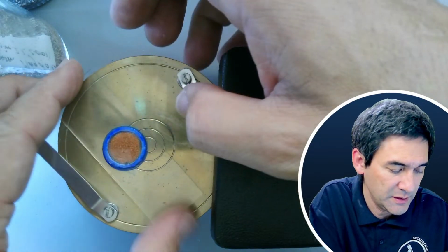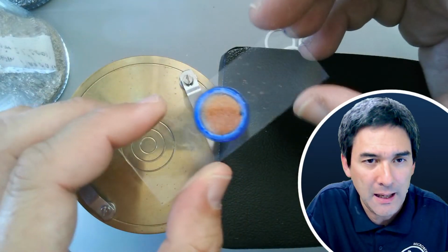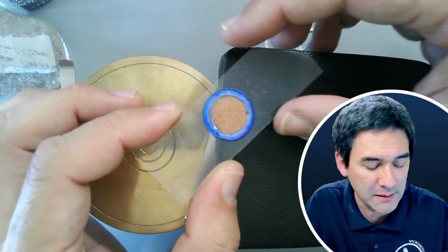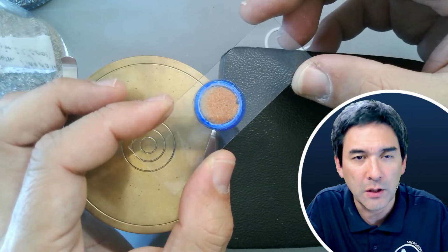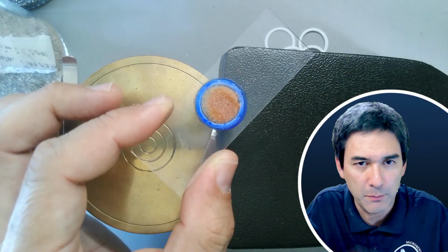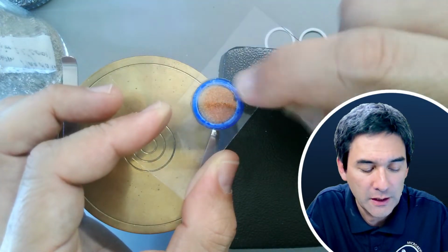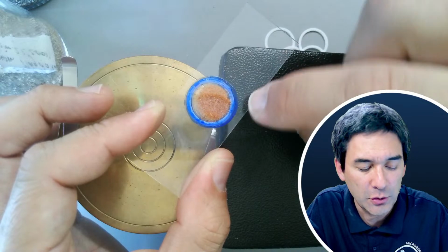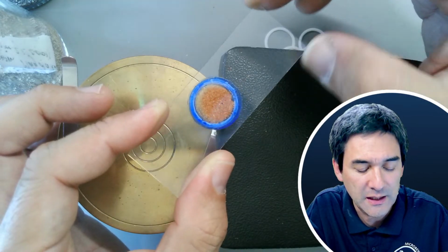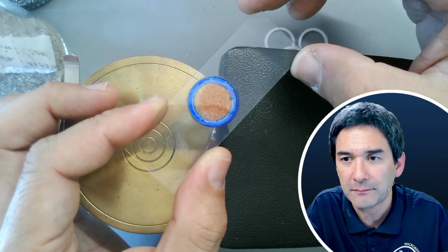Yeah, so I'm still a little bit worried. What I have also made in the past is, and all these things come into my mind as I'm talking, you can also try to paper cover them. You buy yourself a puncher, and you punch out round circles from a piece of paper, and then you can glue it over, and then you have a nice window. This essentially not only stabilizes the cover glass from the side, but also protects the slide from cracking.